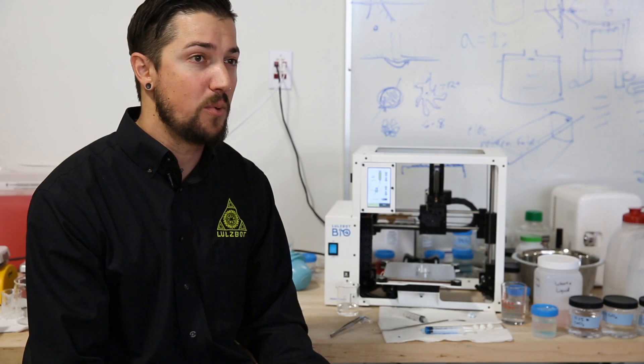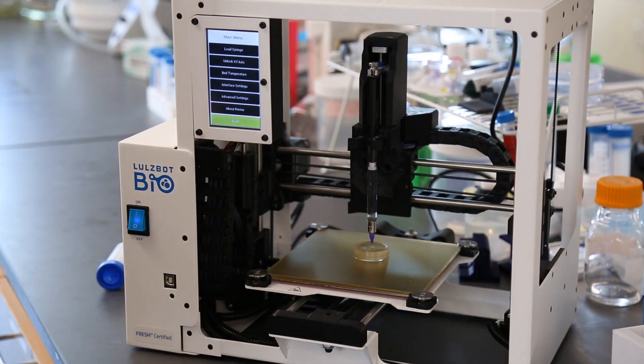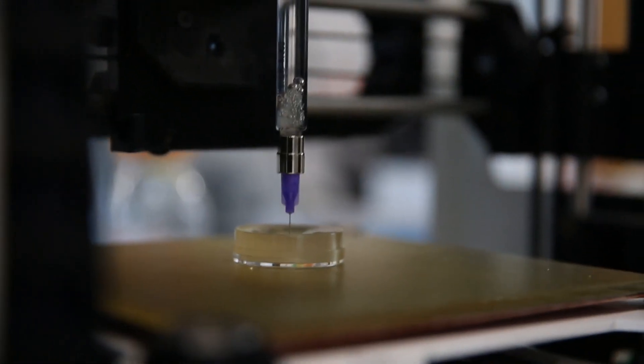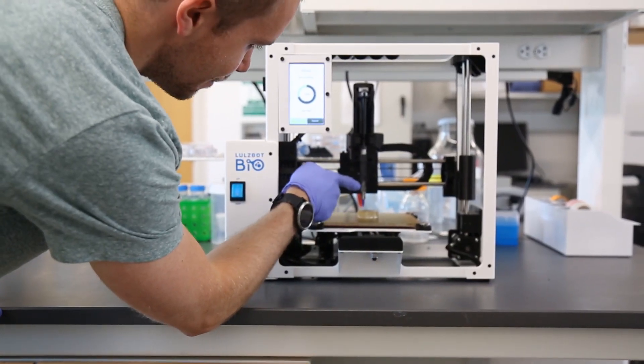Other bioprinters on the market use pneumatic systems which give you poor control over retraction and stopping of the material flow. The result is you have much lower resolution, stringing between extrusions with all these other pneumatic based printers.